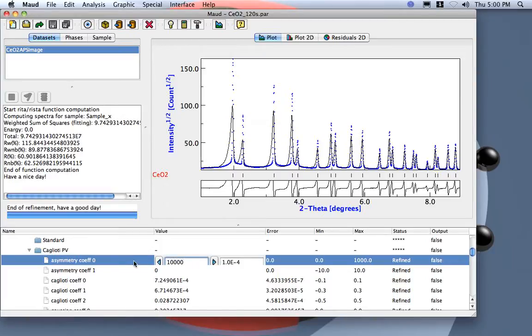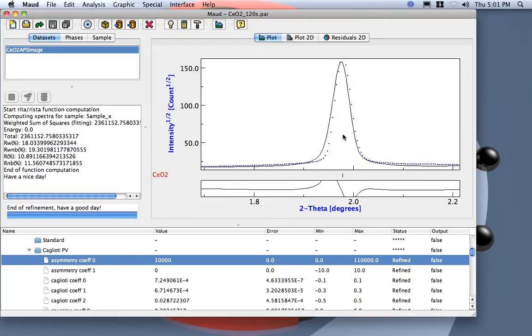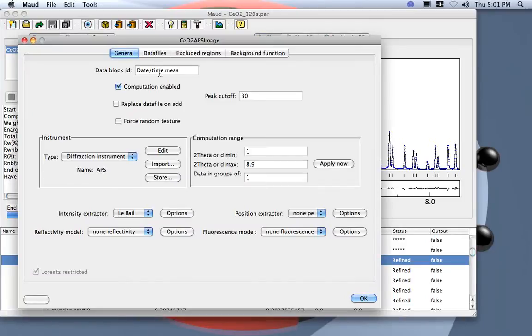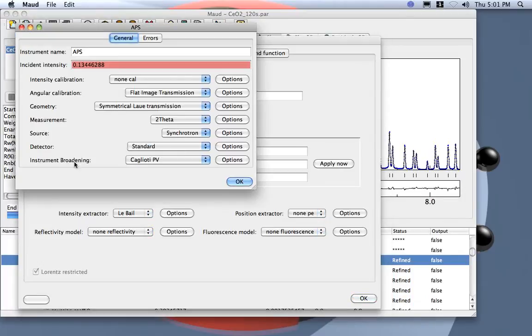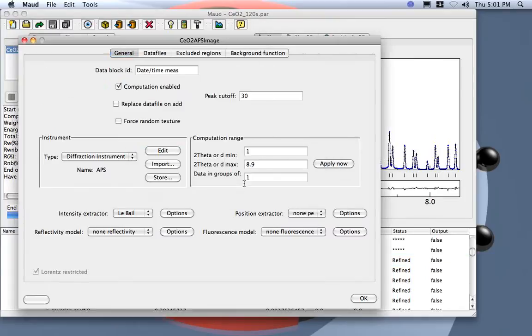For too much I can just put ten thousand. Now it's much less, but it's still the wrong direction. So in MAUD, to invert the direction of the asymmetry, you go to the instrument, edit, we go to the instrument Bragg, Cagliotti here. And here there is a truncation angle. The asymmetry is calculated truncated over 0.4, and if you put a minus sign here, we go to a truncation angle negative, so it's going the other direction.